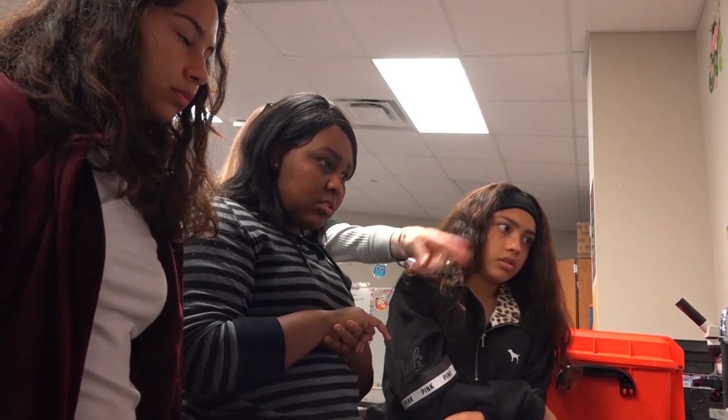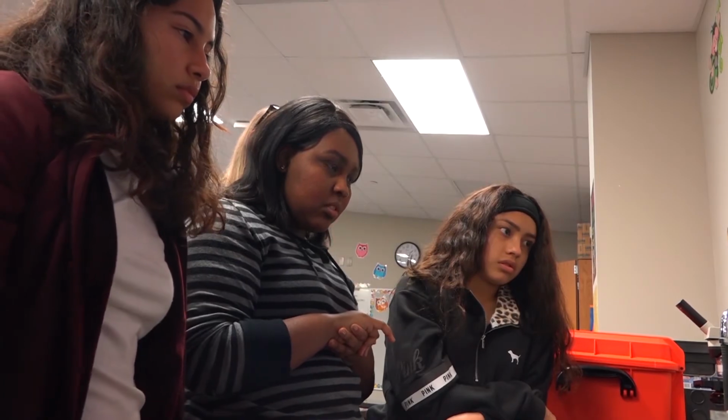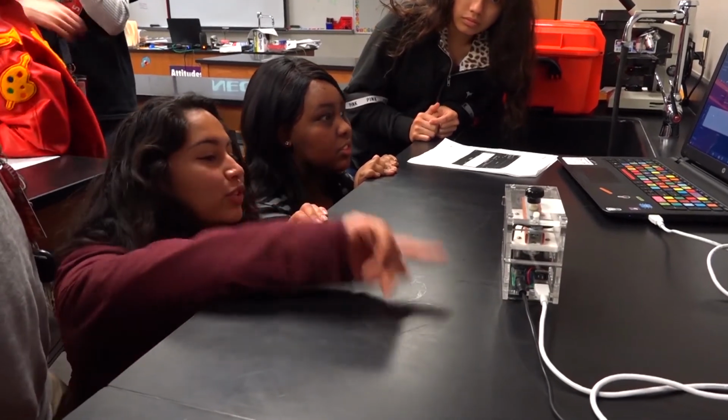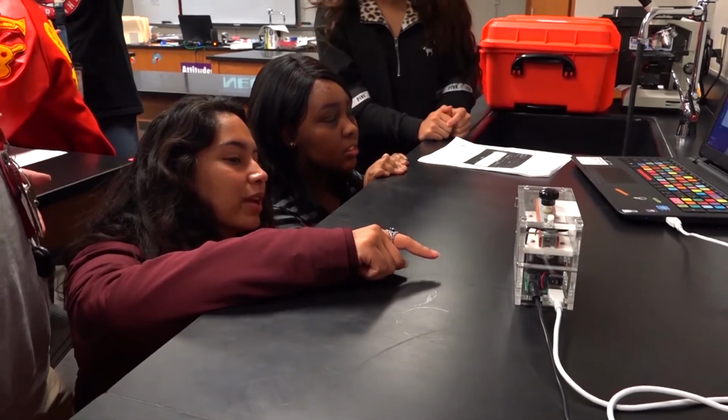And all of this is like a very strict process, and you need to be precise, or you're gonna have to start all over. Being able to copy and make copies of DNA within a matter of minutes is just truly amazing, and it's just gonna push the world forward. Yeah, actually it's pretty cool having it there, because I heard we were one of the first high schools to use it. So I mean, yeah, it was pretty expensive equipment, so I mean, using it was pretty cool. So I mean, I have a head start over other kids who didn't use it in high school, so yeah.